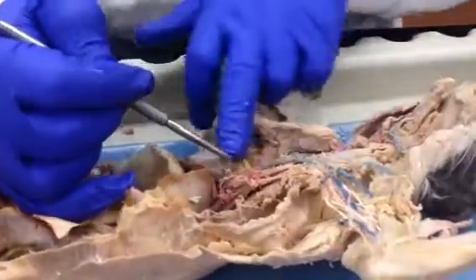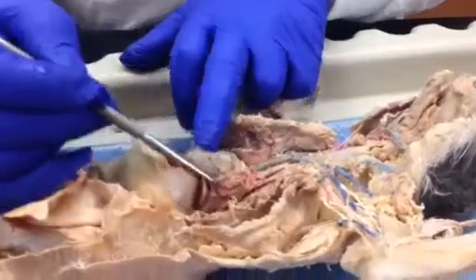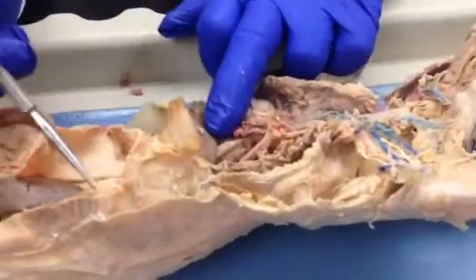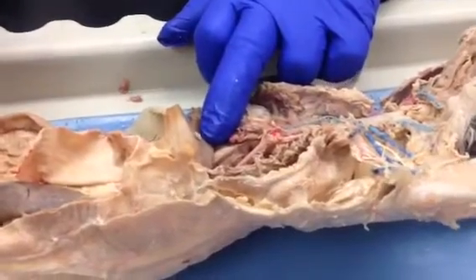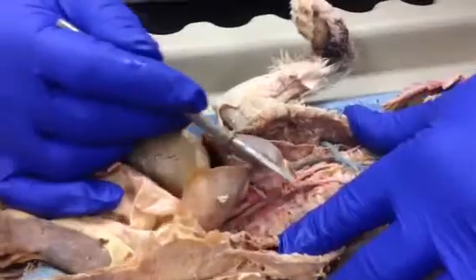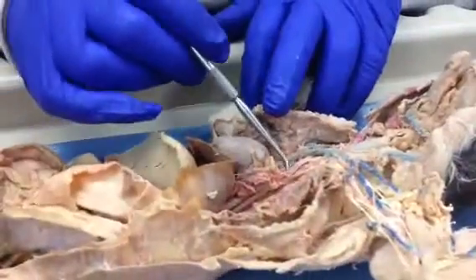All right, so coming off the aortic arch, that's the aortic arch right here. It turns underneath and becomes the thoracic aorta. As it goes through the diaphragm, it becomes the abdominal aorta. You have your intercostal arteries and veins right here along the ribs. Then we come up to the branches.